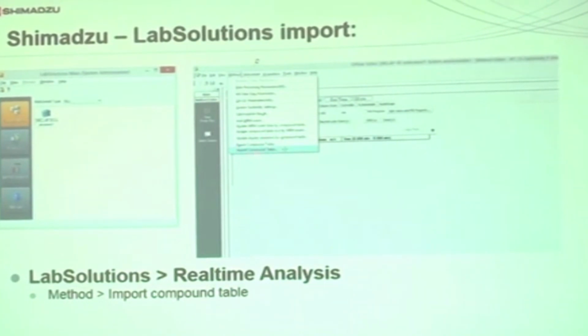After that you will specify what should be the HPLC time program, and whether you want to do staggering. That staggering you can specify, and what column you want to use, that you can specify. After all these parameters are optimized, you can give a run and perform the analysis. After the analysis is over, you can import that result or data file in Skyline software again, and you will be seeing different colored symbols.